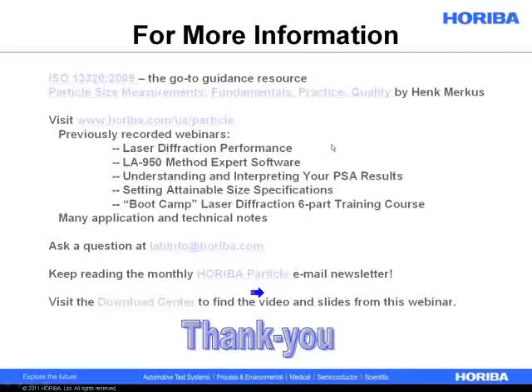Or if you can get away with manually using the fraction cell, you can drop it to 10 milliliters and reduce the cost of purchasing more mineral oil, and reduce the chance that it's going to get everywhere. If you're not so lucky as to use mineral oil, and you have to use something like methyl ethyl ketone or something very strongly carcinogenic like benzene, you may also want to reduce your solvent quantity so that you can reduce your health exposure.